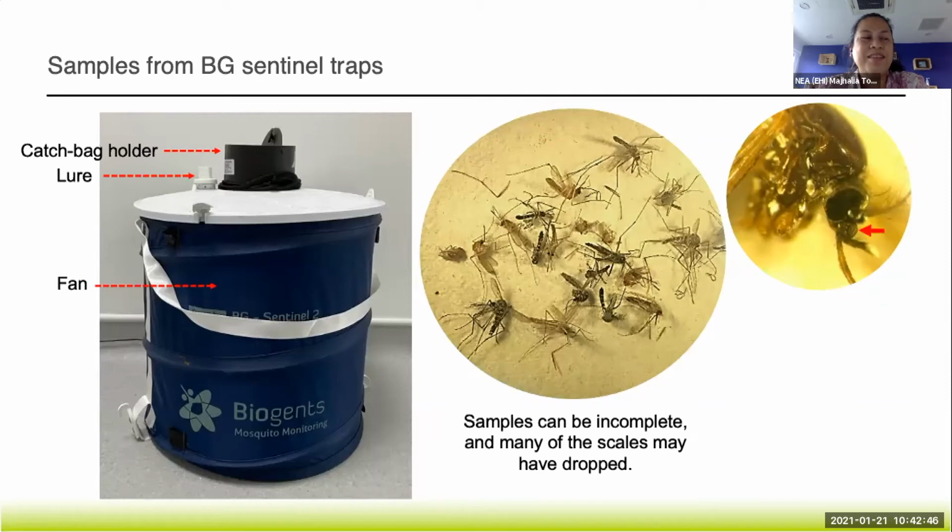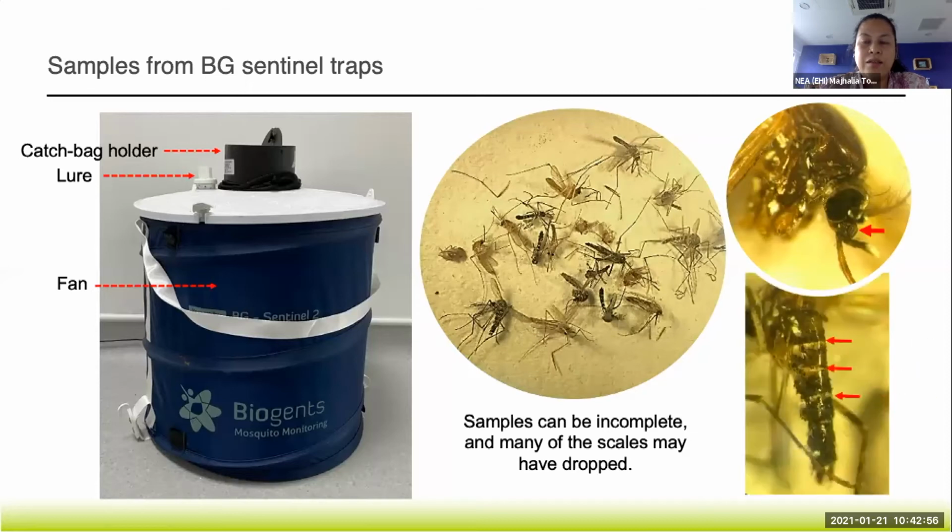Yes, thank you. This is Aedes albopictus because the clypeus, and it is a female, the clypeus is bald, it has no white scales. Then here is another sample. There are some remnants of scales, basal white scales on the tergites. So your guess is?